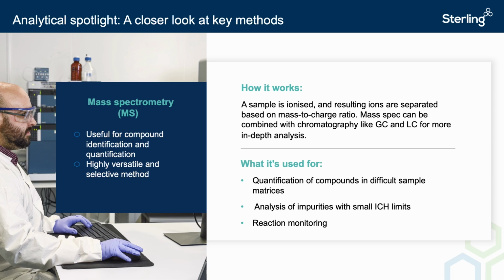The mass-to-charge ratios observed can also provide structural information, especially since compounds often break apart in predictable ways. Compound libraries can be utilized to compare the fragmentation pattern of an unknown compound to thousands of studied compounds to give an idea of what the material might be, or isolated impurities can be compared against the spectra of known APIs to determine if they are potentially related or degradant products.